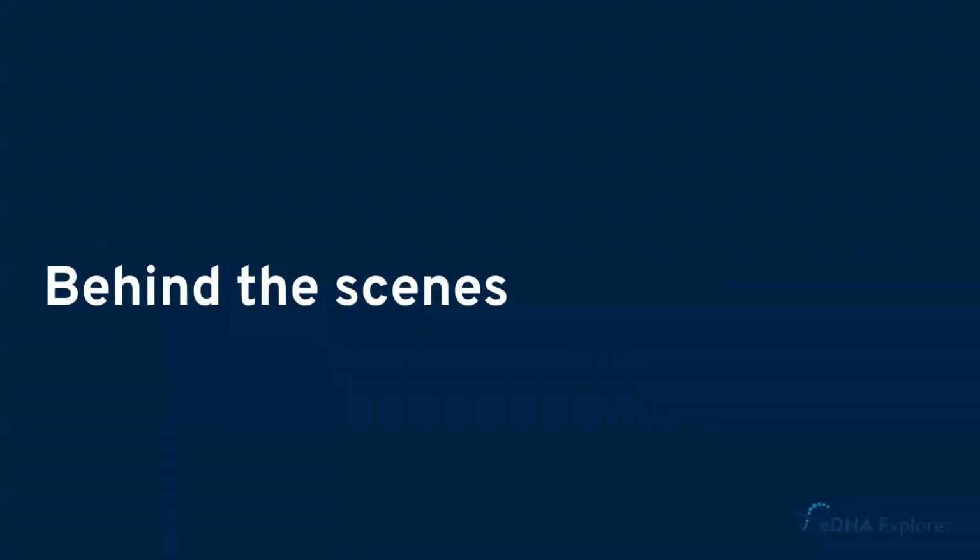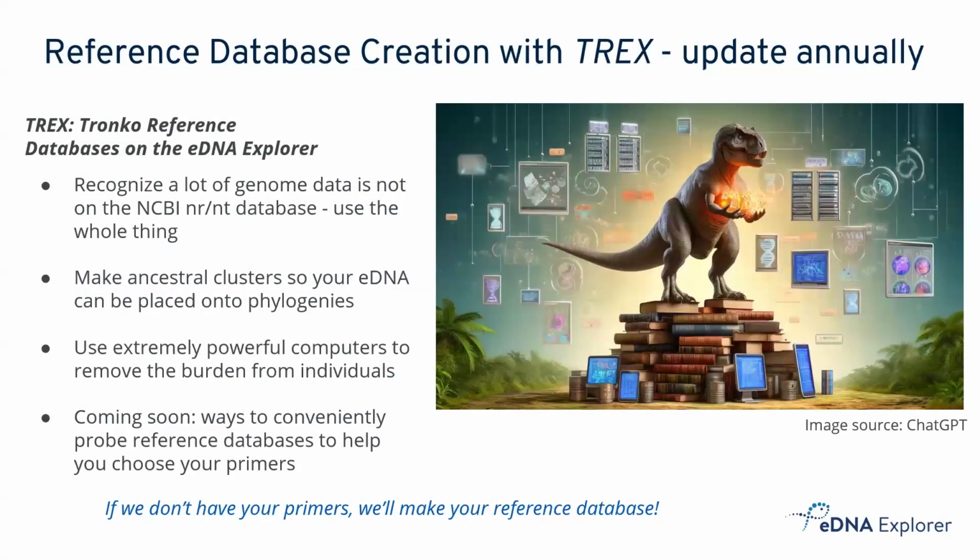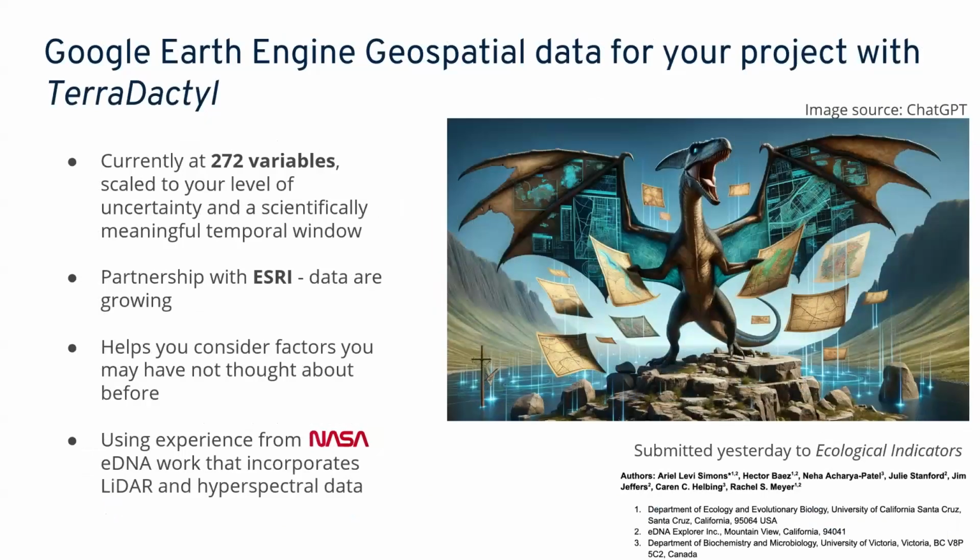A little bit behind the scenes in my final minute, we have a really awesome reference database creator called T-Rex. It's powerful, and it's important when you're using phylogenetic approaches for taxonomy assignment to have a really comprehensive reference database. So if you want a reference database made, we can make it for you.